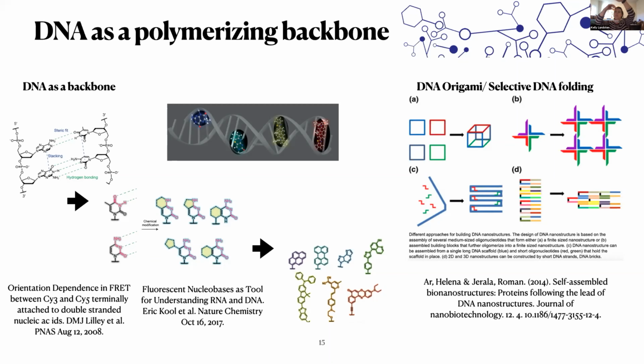They're crazy, but that's not helpful for us. We want exclusive excitation. You have exclusive excitation and you have defined emission. That's what we're looking for: no promiscuity.